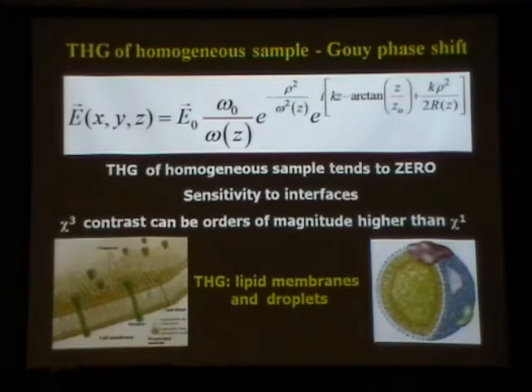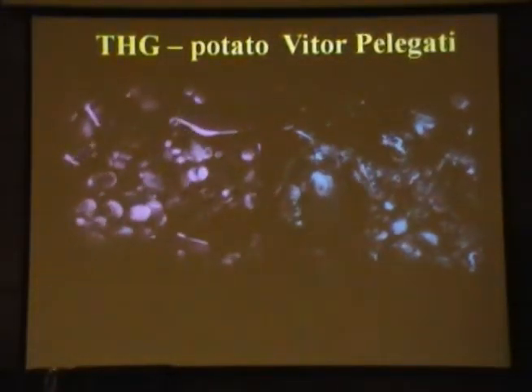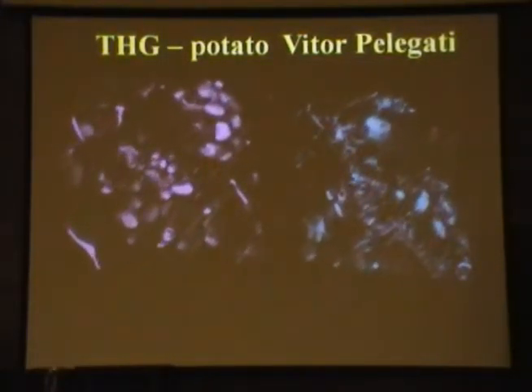Okay, and with the Olympus, I had a kind of movable PMT that I just put in front of my sample. I did not use the condenser, I did not use anything, I just put it in front of it, and the third harmonic was there. And with the Zeiss system, I don't have this movable PMT, so I cannot use it. If I try to unplug, then the security of the system will turn off the whole system. So I'm still fighting. I think I have to send the third harmonic generation through some other pathway to reach the detector and try to change the Zeiss system in order for it to detect and to reconstruct the image.